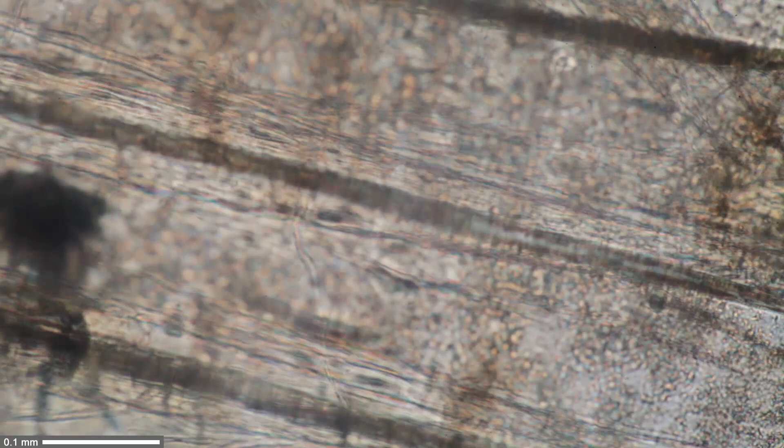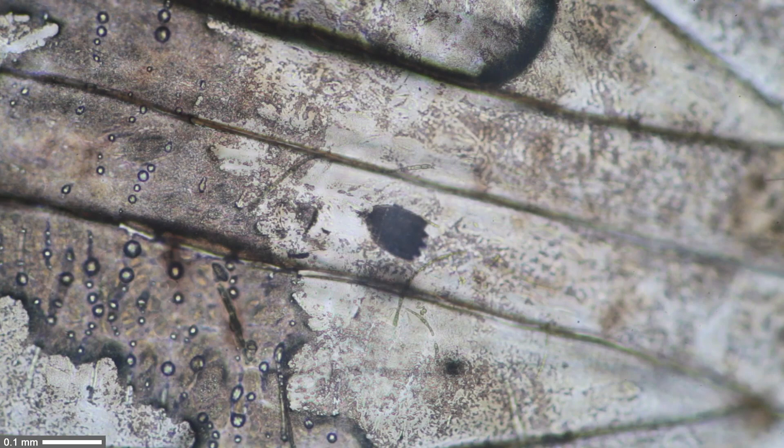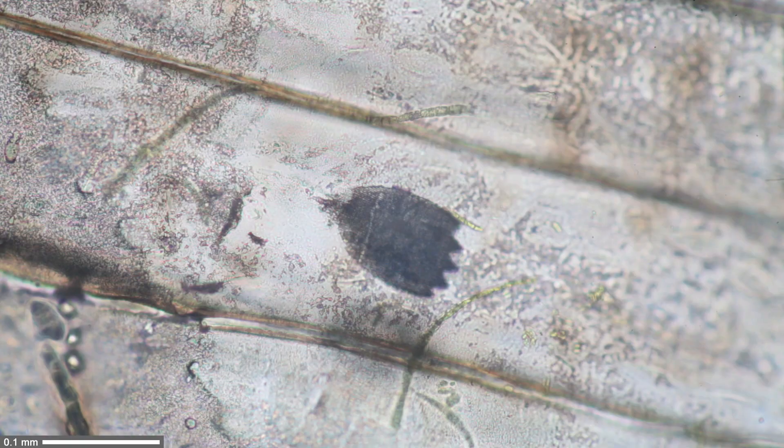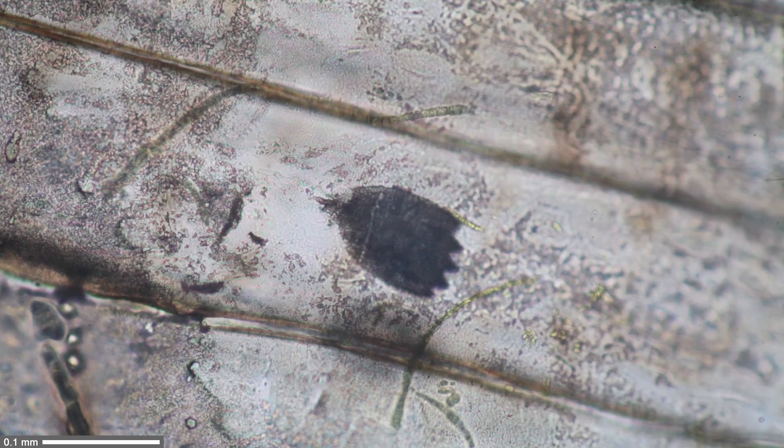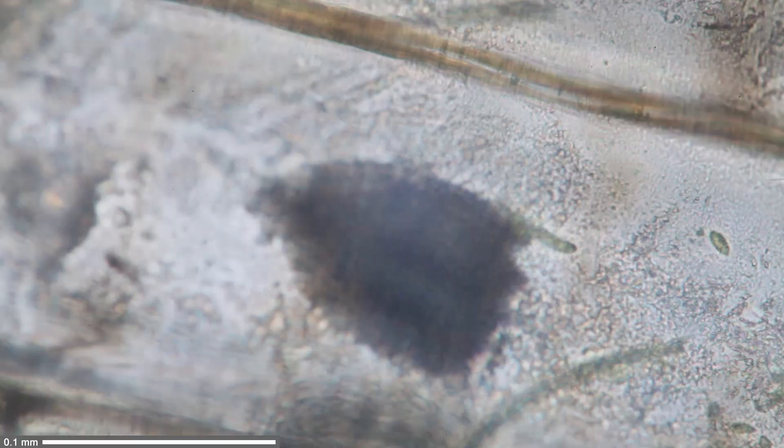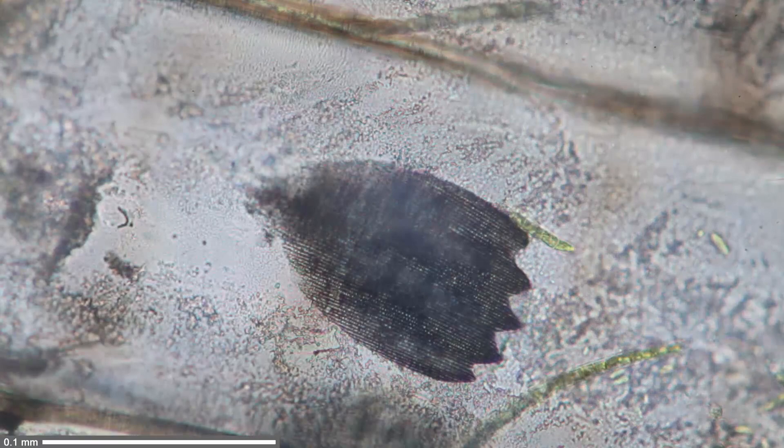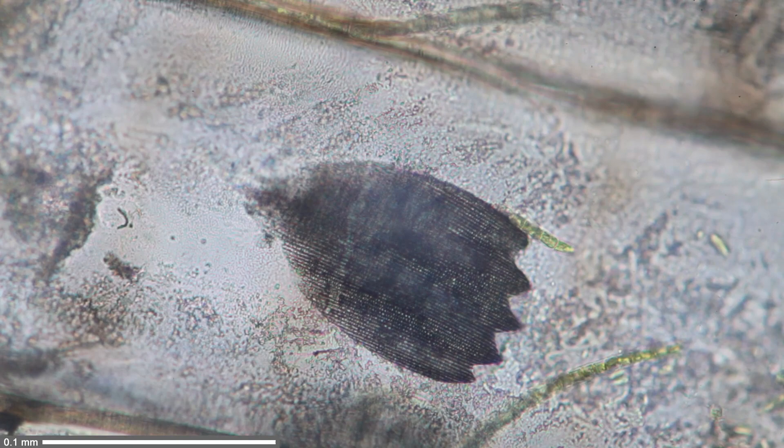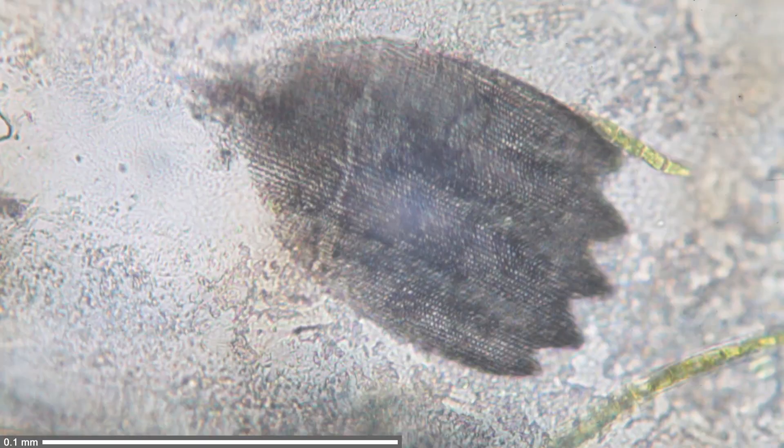This black structure you see in the center right now, that is a scale of the butterfly. This means that when the butterfly emerged, it lost one of its scales. This is something I'm actually looking at here right now. I'm again playing around with the condenser a little bit. This is why the brightness changes. Yet at a higher magnification, you can actually see some of the structural details of this scale. These scales can be quite commonly found also in house dust, so if you ever see something like this in house dust, then you know that probably a butterfly lost this.